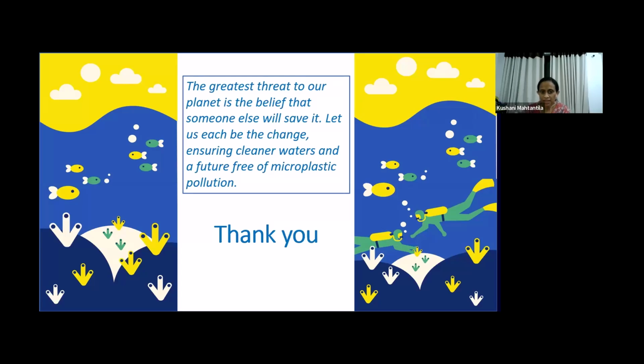And we use the ARC software for automated counting. It is recommended by CEFAS UK, and for the optimization we have to adjust the intensity of the red, blue, and green light accordingly. That is how we do the automated counting.